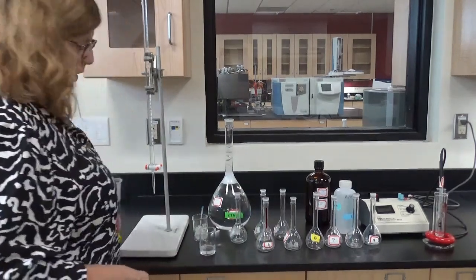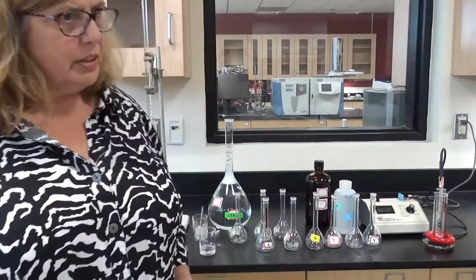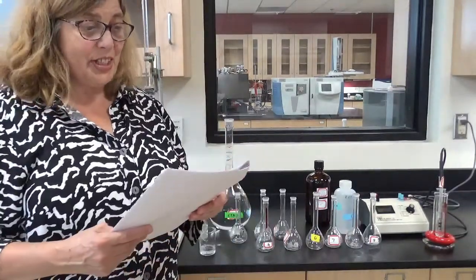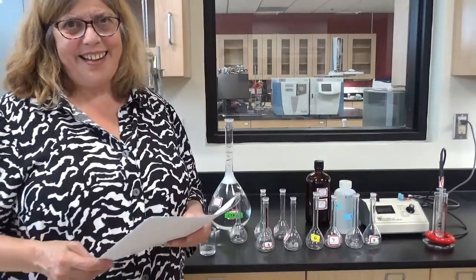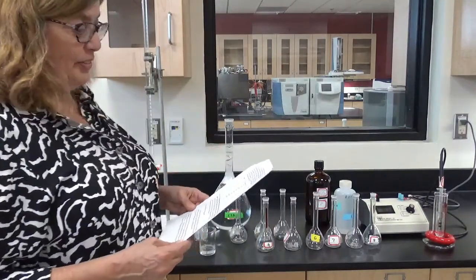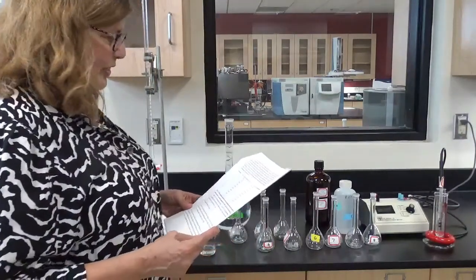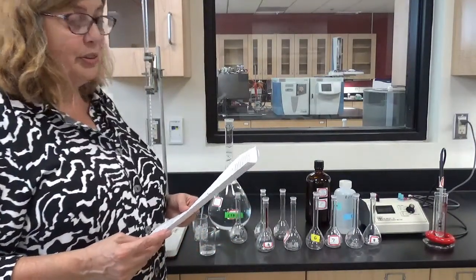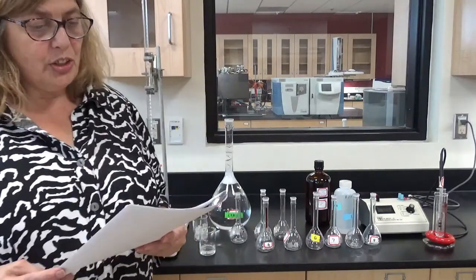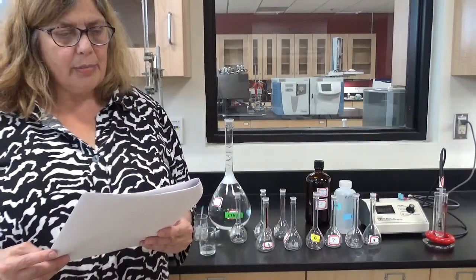Okay, and my first solution, let's see, where are my directions? Oh, the first solution has 0 milliliters of the stock CTAB. And I said 4 milliliters of phenanthridine, but I lied. It's really 5 milliliters of the phenanthridine. So how about if I go directly to solution number 2, which is supposed to be 5 milliliters of the CTAB.